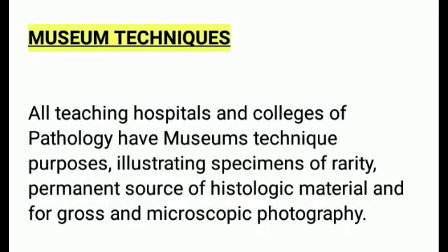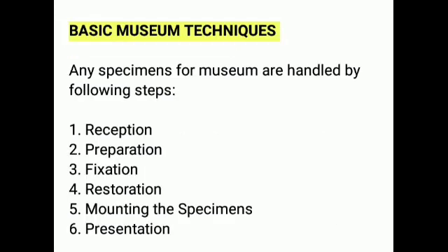Hospitals and colleges of pathology have museums for technical purposes: illustrating specimens of rarity, serving as a permanent source of histologic material, and for gross and microscopic photography. Basic museum techniques. Any specimens for museum are handled by following steps: reception, preparation, fixation, restoration, mounting the specimens, presentation.